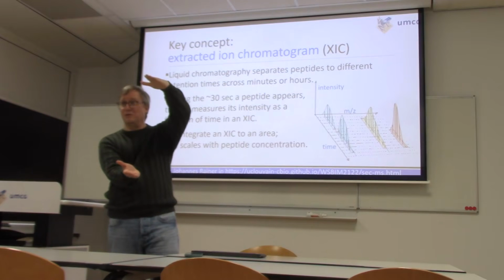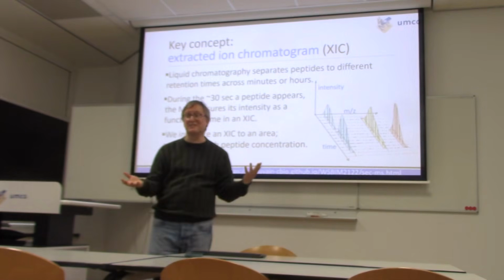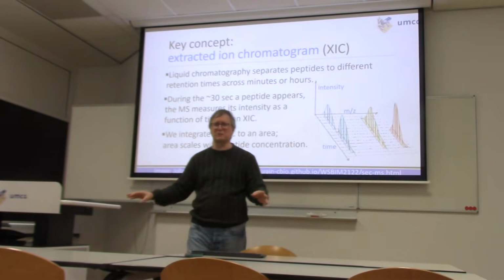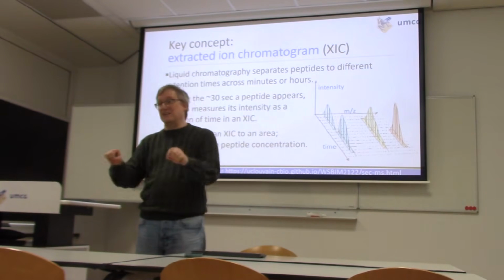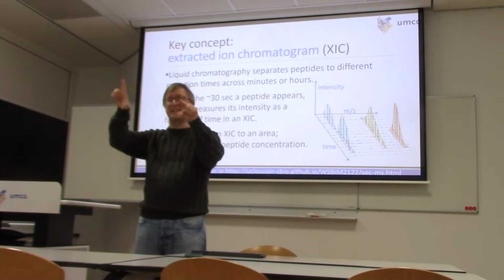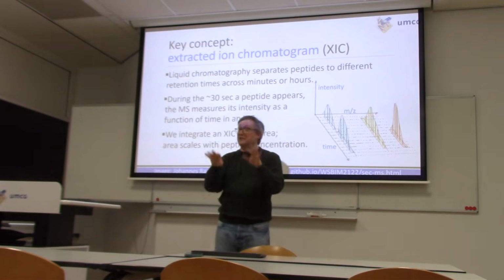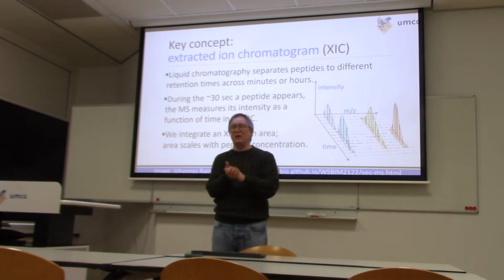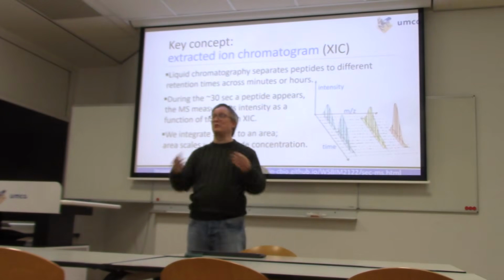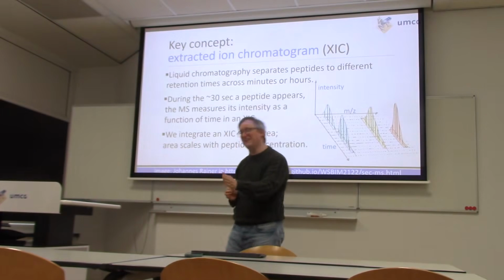An intensity value nominally tells us about how many ions there are of a thing. But different chemicals at different mass to charge values have very different ionization potentials. As a result, the intensity of an ion may be larger than the intensity of another ion, and yet there may be less of it present. It's just ionizing better. So we have to be relatively careful when we start making bold statements like, if the intensity is higher, there's more of it there. If you're comparing for the same ion, that's true, generally.